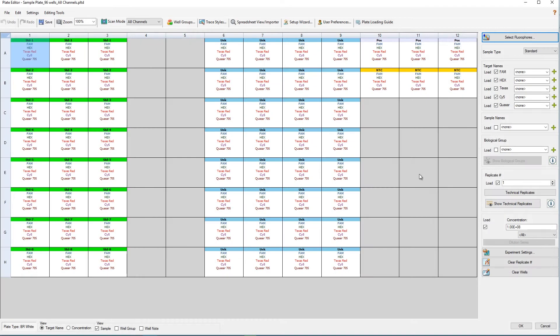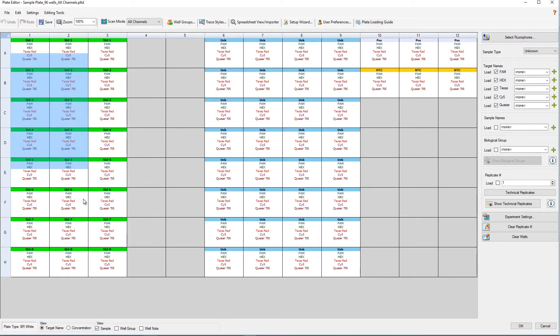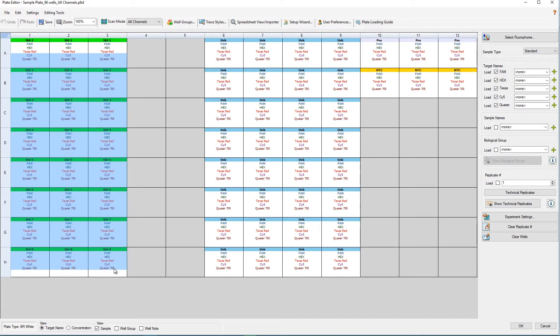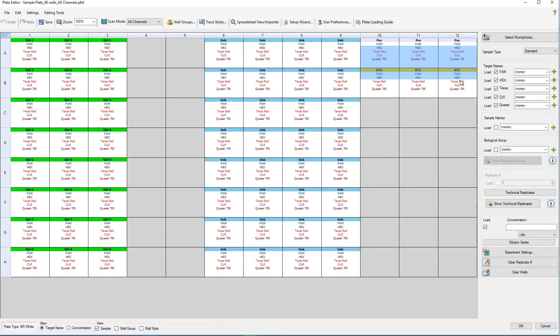And here's what a fully designed plate can look like with standards, samples, and controls.